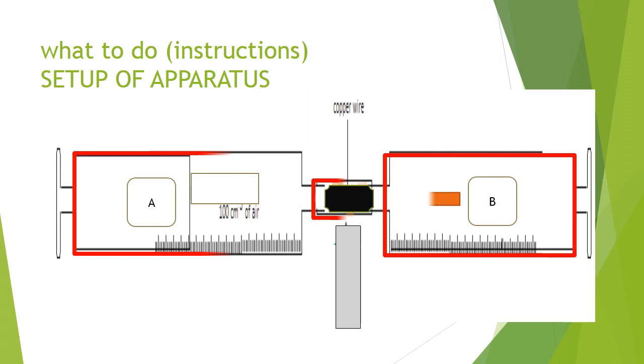You find that the amount of air which has remained has reduced. This means that part of that air has been used to burn the copper turnings.